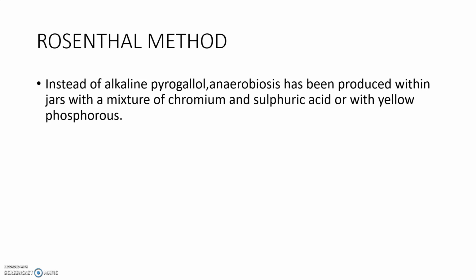So today's class is up to this. In the next class we can discuss the gas pack, biological methods, and the anaerobic culture methods using reducing agents, and also two types of medium which are involved in anaerobic cultivation.